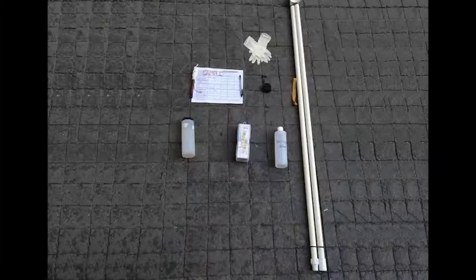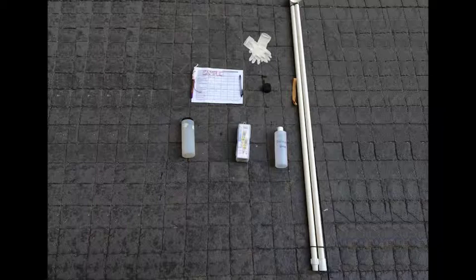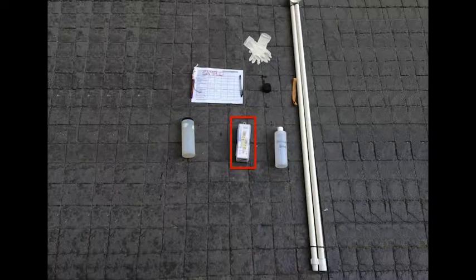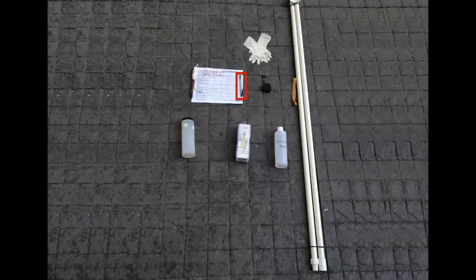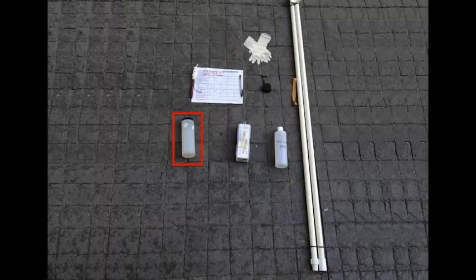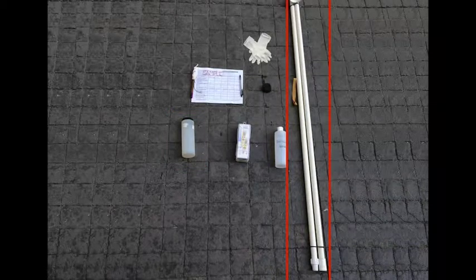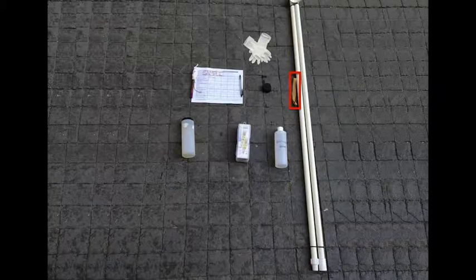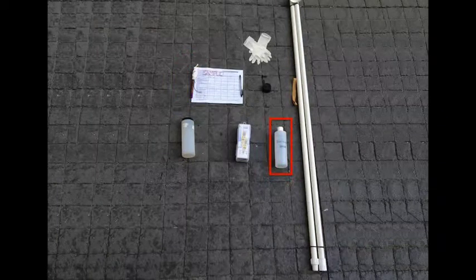Use your calibrated ECTestr to take measurements for road salt monitoring. For this test, you will need ECTestr, road salt monitoring datasheet, disposable powderless gloves, pen or pencil, ISCO sample collection bottle, a rubber stopper, sampling pole, a large rubber band, a handheld thermometer, and distilled water.